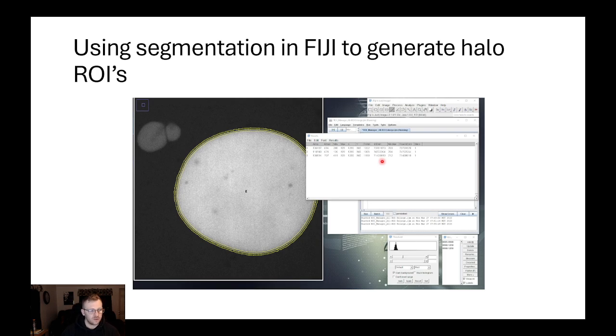So this is how we get from that quantitative histogram to real data. I'm measuring the sum of all the proteins inside of that nucleus and the brightness and the intensity of all those proteins that are located inside the nucleus. So that translates to an actual number of proteins.